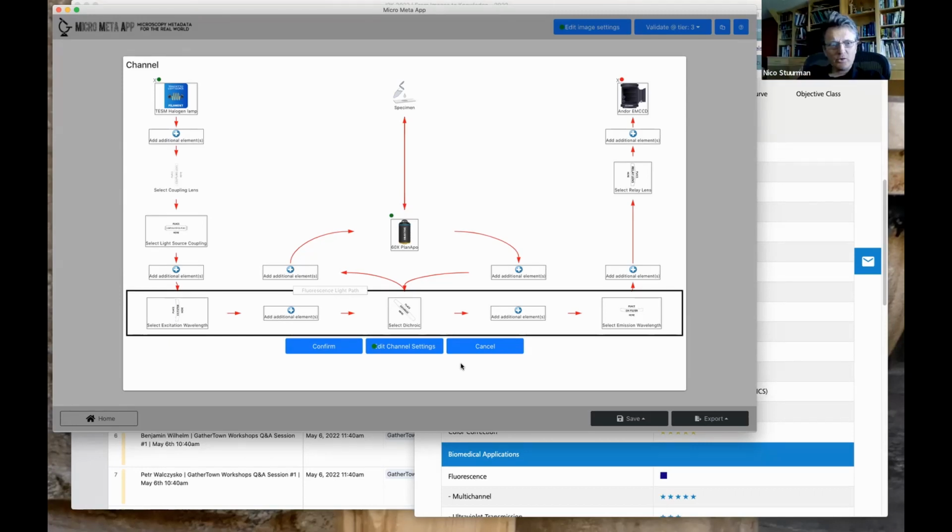I would even argue that, like in the example you're doing now, most of this is boilerplate. There's just one or two things that may be different, and so it would be very important to have the actions of the users only be those one or two things, and the UI focused on those one or two things and not everything, because people will not do it.